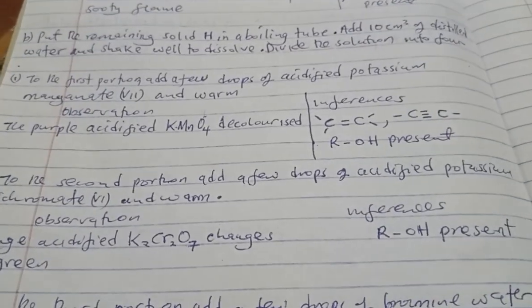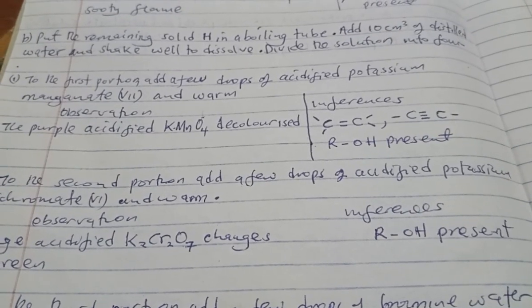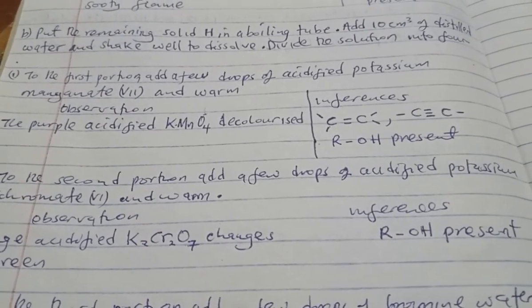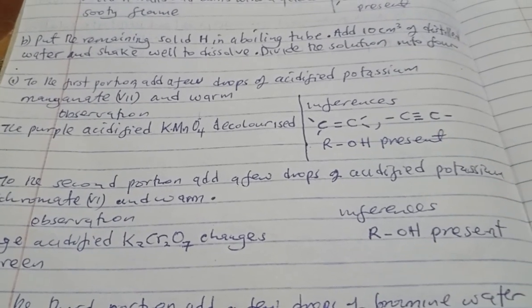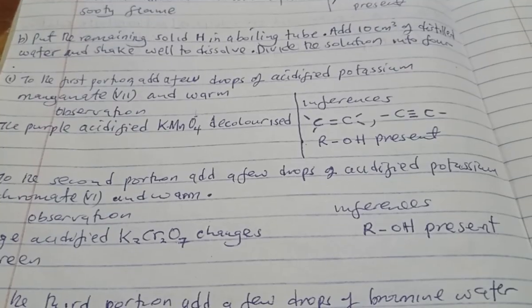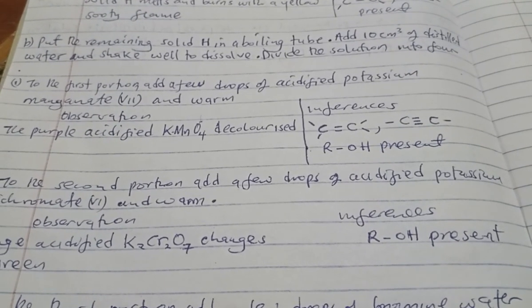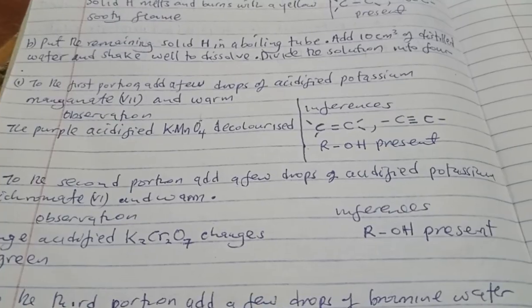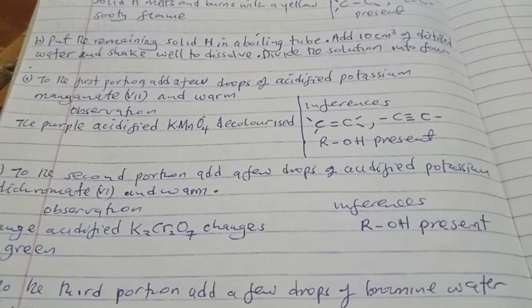So if the purple acidified potassium manganate(VII) decolorizes, or changes from purple to colorless, then you can say under inference that the double bond, the triple bond, and ROH are present. Remember, 3 of them are present.